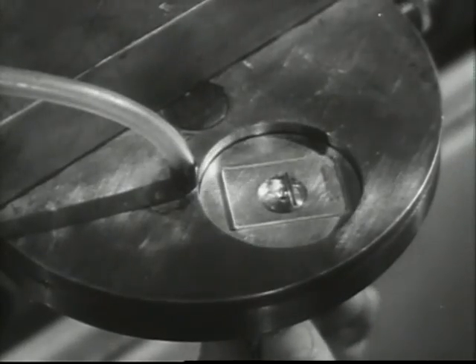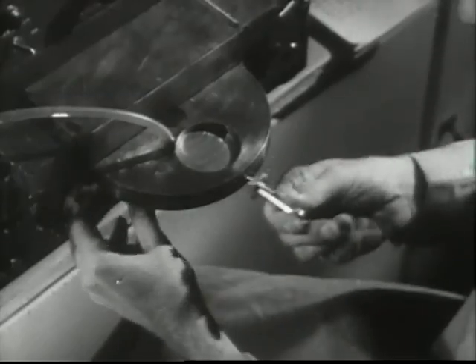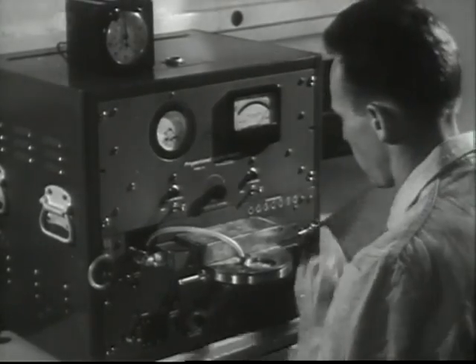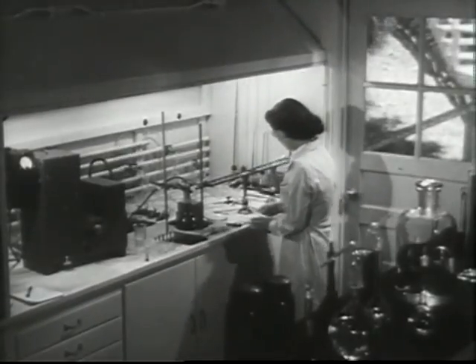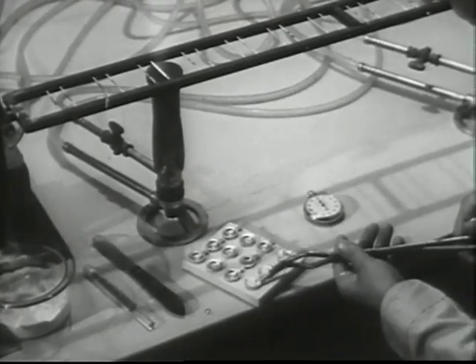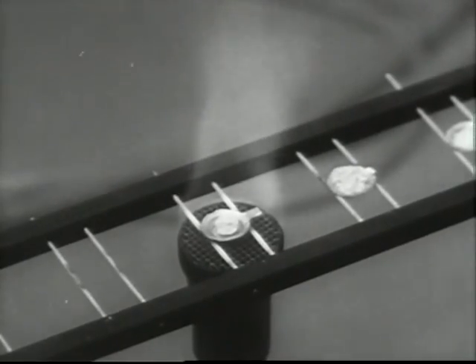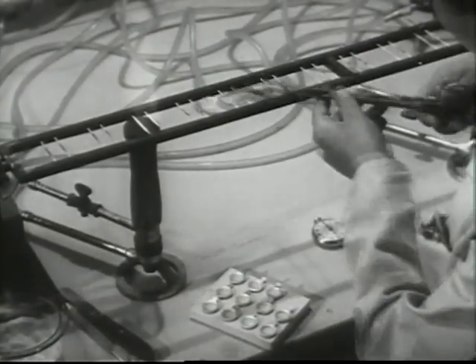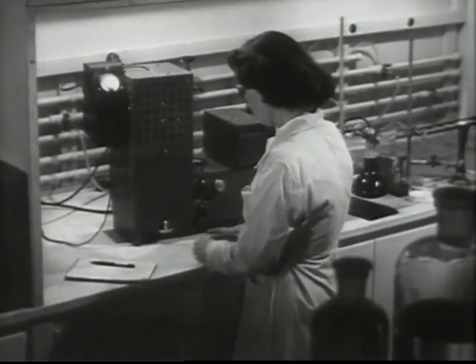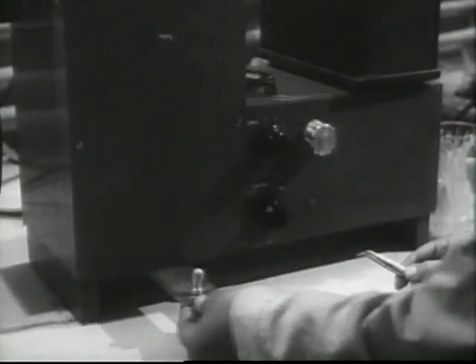Should an excessive amount of radiation register, steps to control it would be taken immediately. Samples go also to the laboratory where they will be subjected to chemical analysis, as you see being done here. This test will determine the amount of uranium in the sample. This is but one of the many precautions taken by the Atomic Energy Commission to protect the workers at their jobs.